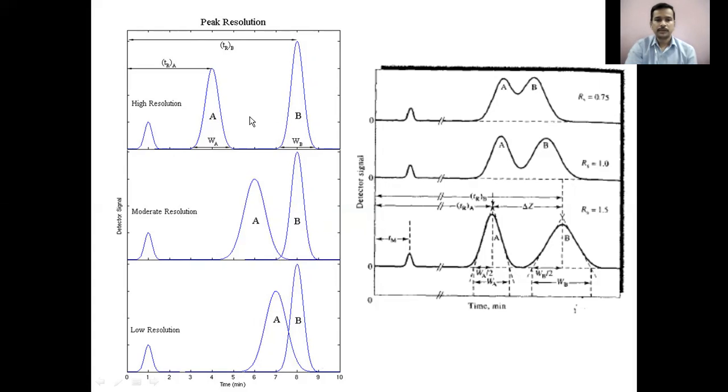You come here in this particular chromatogram. This is the chromatogram obtained by the separation of solute A and B by using some other chromatographic procedure. So A and B. Another chromatographic procedure was followed in which the column was different than the columns used in this procedure and in this procedure to obtain these two chromatograms. Here, peaks are well resolved, well separated with almost symmetric baseline widths WA and WB. So TRA you can have, TRB you can have.